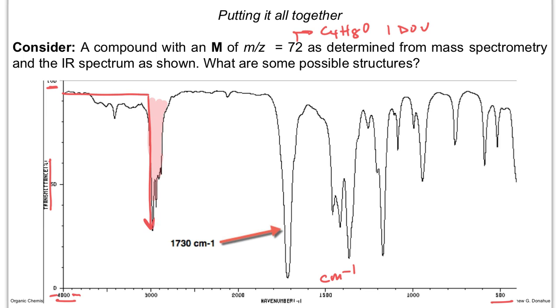As we progress back up this jagged stuff, notice that it starts going back up here, and we could call that the baseline. And then there's nothing. Then it hits this other thing, it starts going down. That's another signal. So we go through there, boop, go back up.